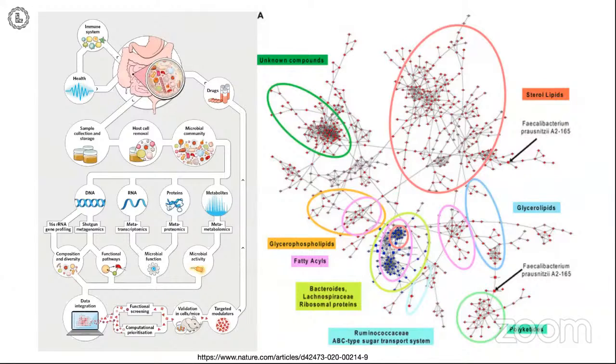So to understand these challenges and the changing nature of such data, we need to look more closely at metagenomic sequencing data and ask what kind of information it can provide for microbiome studies.